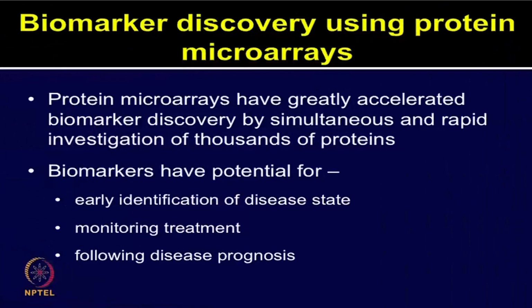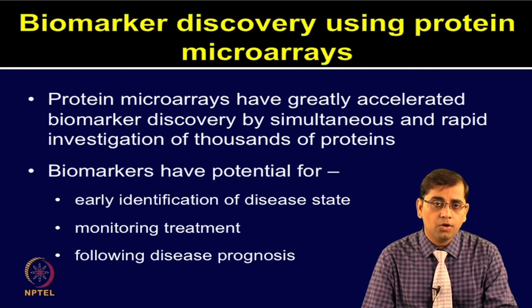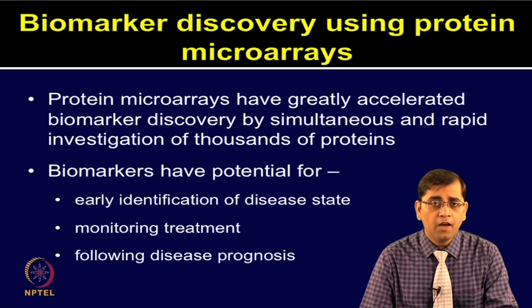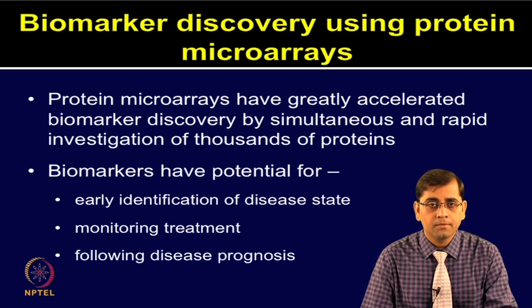Let us now look at some applications of cell-free based protein microarrays, focusing on biomarker identification. Biomarker discovery for disease detection and pre-screening has been one of the major focuses of researchers in the proteomics field. Biomarkers have potential to allow early disease detection as well as accurate diagnosis of the grade of the disease.